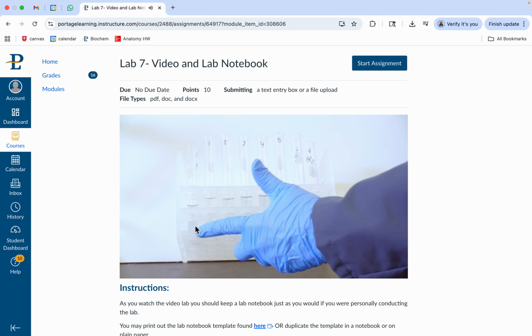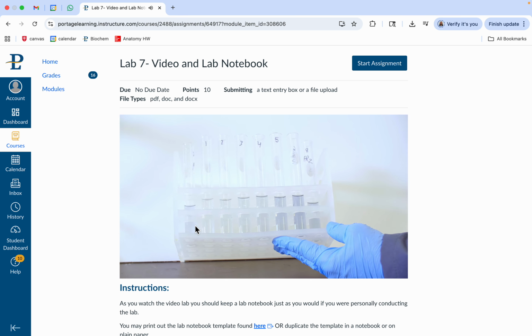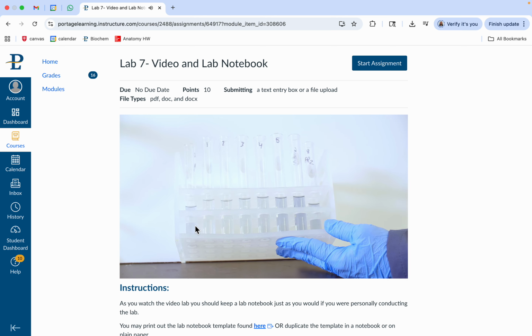But then we also assay fraction 1 and fraction 2 to get their concentrations. And we actually did this for the other compounds as well. Noticing that our fractions have higher protein concentration. It doesn't have as much as the total, but it has a good concentration. We're going to give you these values for FR1, FR2, and a couple of the others in our final data table. But getting total protein concentration is also a good step to confirm that you have protein present and to see how much is there.